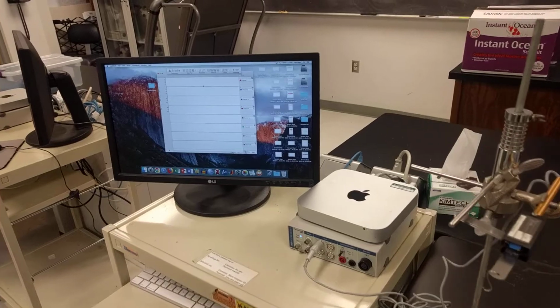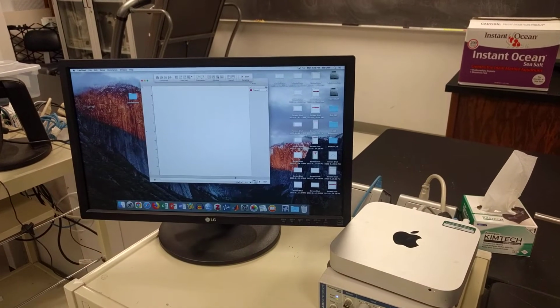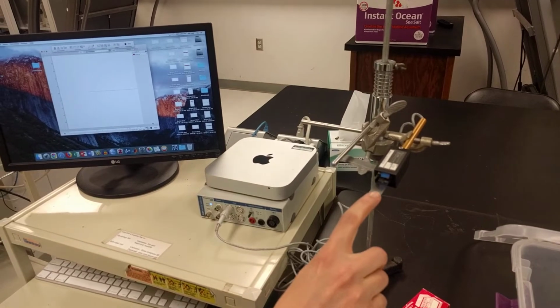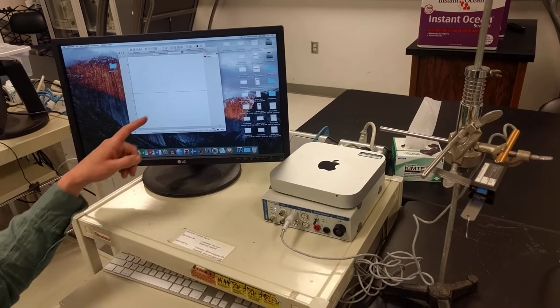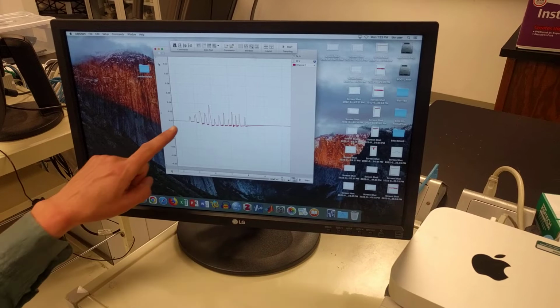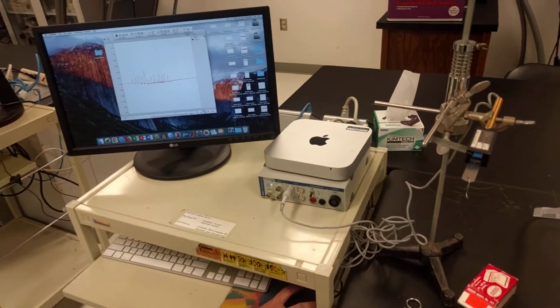So over here, since we're just working with channel 1, I'm going to drag everything else down, so I'm only looking at channel 1. Then I can just start my recording, okay? Test your transducer to see that it actually is working by tapping on it. If you come back over to the recording, I'm going to pause, and I'm going to auto scale here. So notice I am getting a signal when I tapped on the transducer, so that's a promising sign.